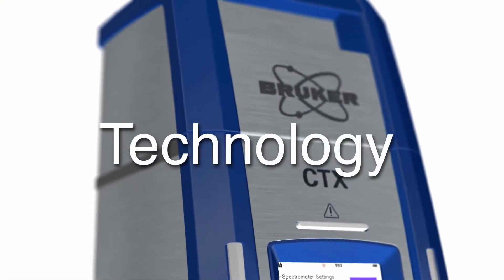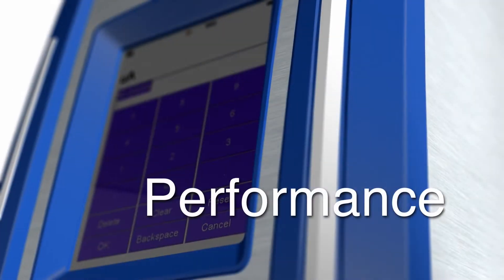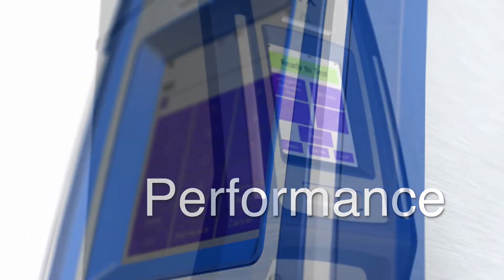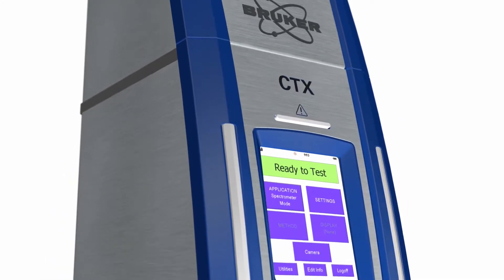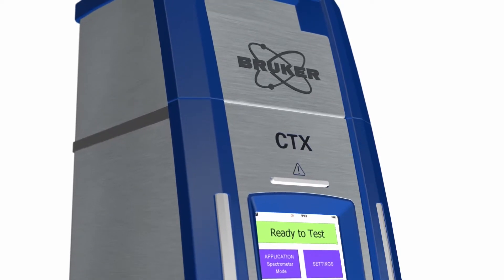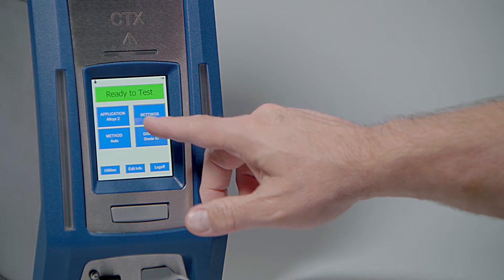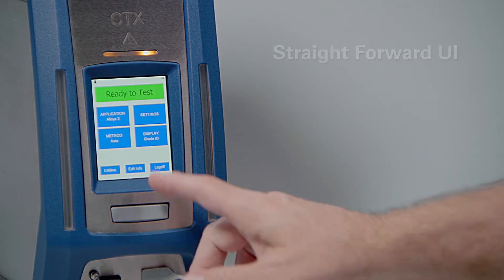The CTX is designed with the technology, safety design, and performance you have come to expect in analytical instruments from Bruker. The CTX incorporates all the portable XRF features you would expect for handheld XRF, but in a self-contained, safety-interlocked portable unit. The CTX has the same onboard software features as Bruker's proven S1 Titan.